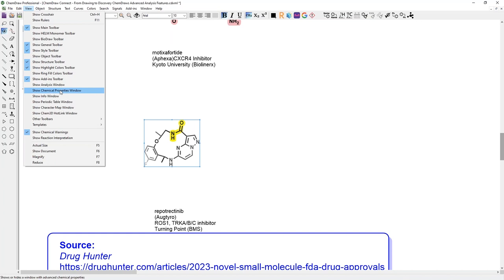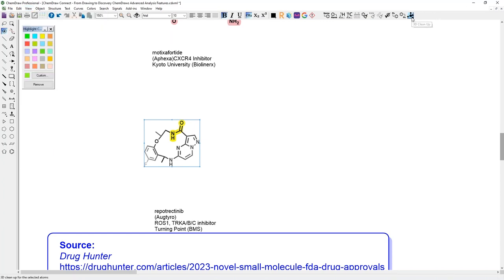You can predict NMRs in there, so there are some basic settings in the preferences also affecting those NMR predictions. And of course, you can also transform the structures, as we just looked at the end, to get 3D representations for the different use cases, either in here with the 3D cleanup, in Chem3D, where you can also run extensive optimizations, distance measurements, etc., or as a 3MF format to, for example, incorporate in your presentations.